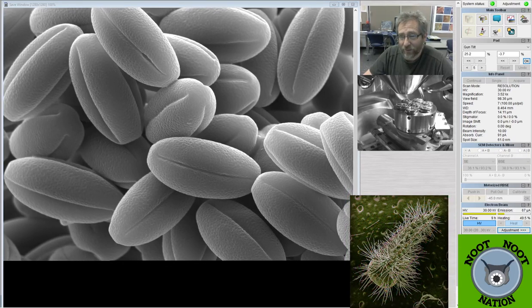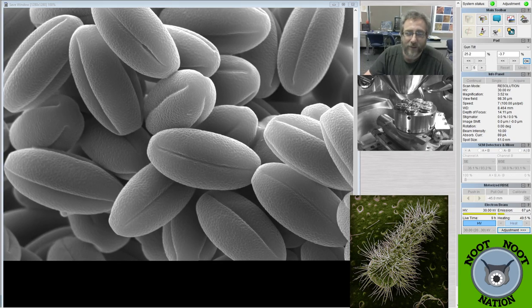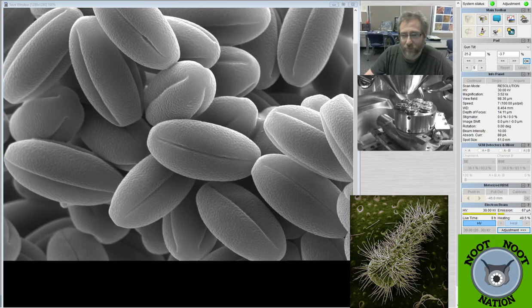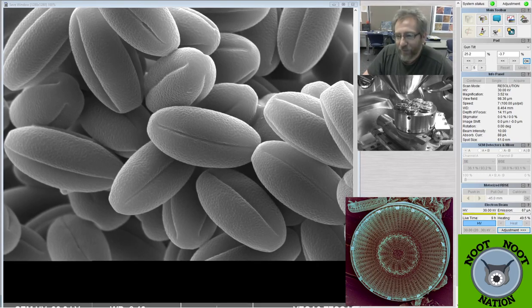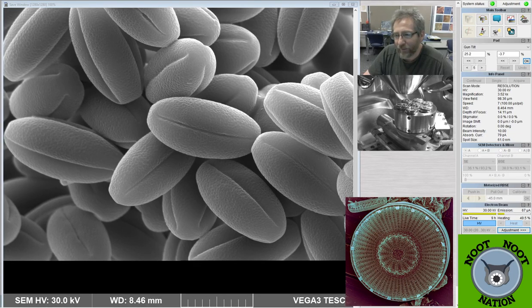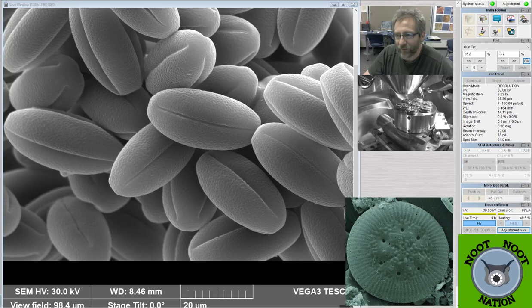Well, if you want to study pollen, this might give you some ideas. If you're interested in aquatic organisms that are microscopic, you've come to the right place. I primarily study diatoms, but we put anything in the SEM as long as it fits in there and I feel like looking at it. So feel free to stick around, and for Spider ID, I know it's getting late for you, so if you have to head out, that's fine.